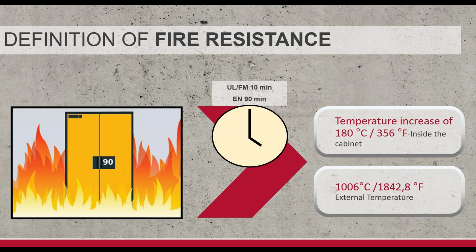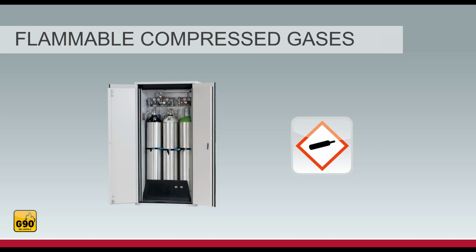I did allow us enough time here to watch one more video, and then we'll conclude for questions and stuff. But as you walk around a space, another thing that we're just missing in North America in general is the way we take care of these flammable gases. We saw hydrogen. There's a variety of different flammable gases out there, acetylene and stuff. So here's a cool video that just says we ought to pay attention to this type of technology. If it's a flammable gas, we need to get it in a fire-resistant cabinet. There are 90-minute fire-resistant cabinets on the market that will keep people safe, because these explosions are quite nasty.